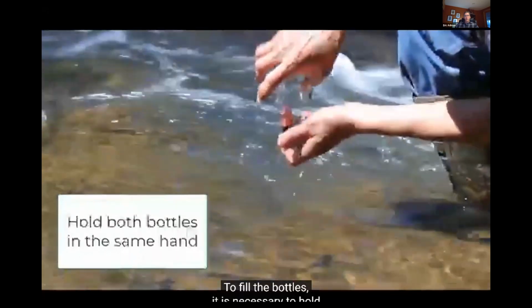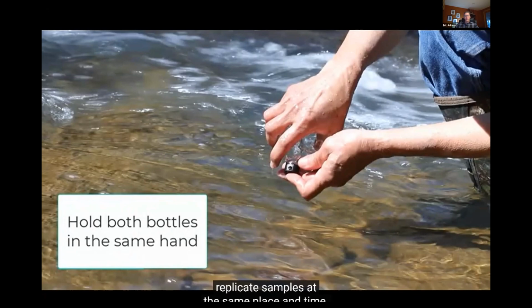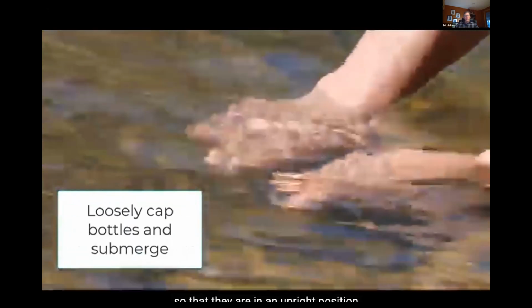To fill the bottles, it is necessary to hold both sample bottles in the same hand. This ensures that you are collecting replicate samples at the same place and time. Completely submerge the capped bottles under the water so that they are in an upright position that will allow the bottles to fill with water while all air bubbles escape.